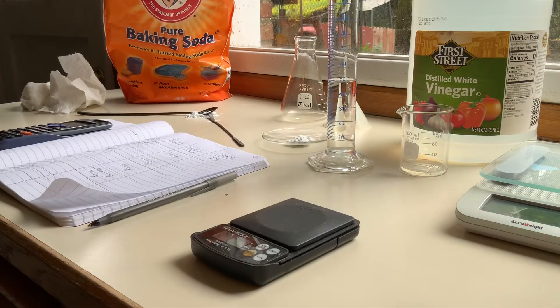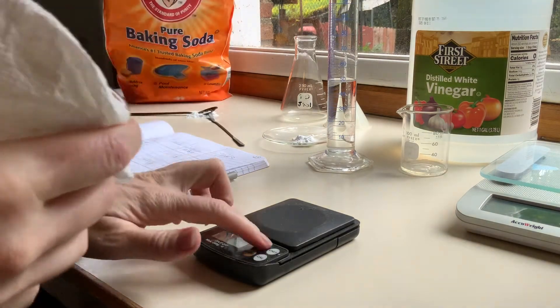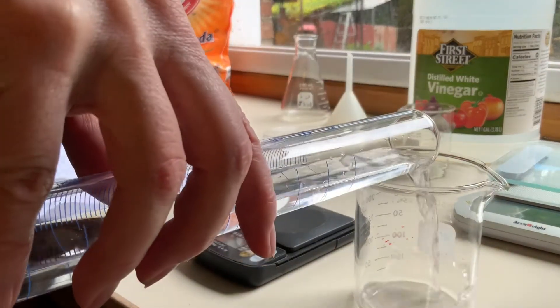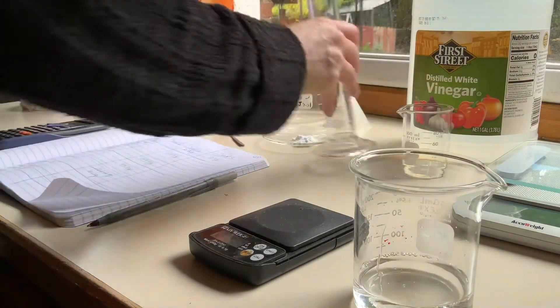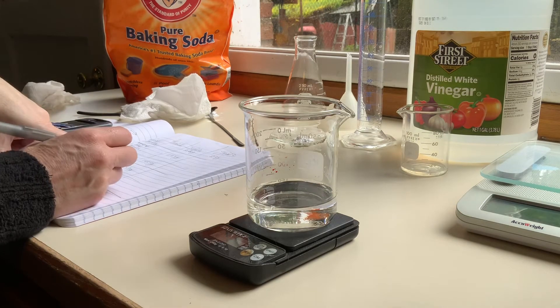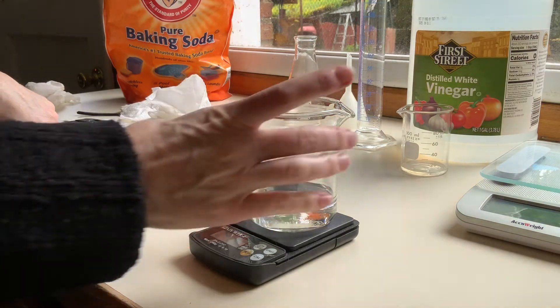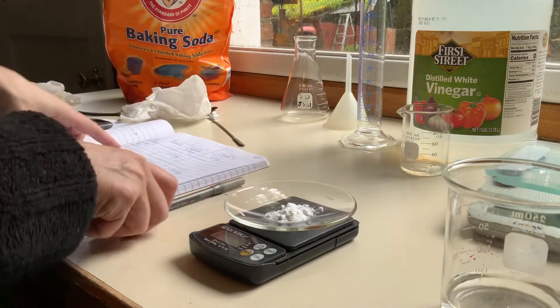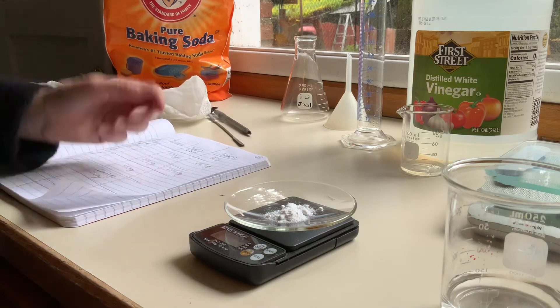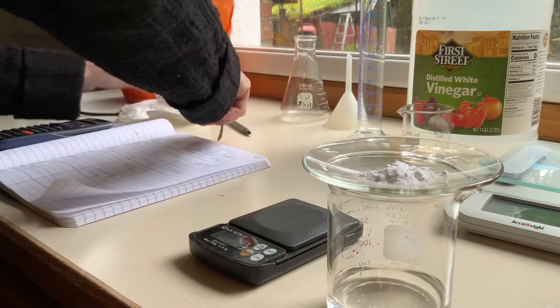Let me get my beaker, make sure it's clean and dry, re-tare the balance, and add my acid. The mass of the beaker with acid before the reaction is 159.5 grams. I'm going to weigh the watch glass with the baking soda before the reaction, and that is 57.9 grams — the same as before, which seems consistent. You'll add those together to get the mass of the reactants, and then we're going to do the reaction.